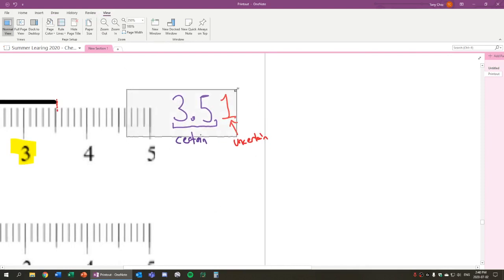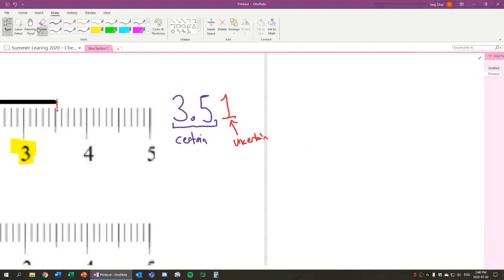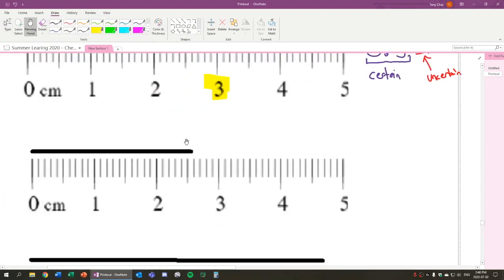Let's try the next one. The next one here is going to be 2 point what? Well, it's going to be 2 point. Now, if you look at it, has it passed the 2.6 mark yet? And the answer looks like it's no. So it's 2.5 what? It could be 2.58. It could be 2.59. But it's one of those values. Remember, the last digit there is uncertain. That's why it's fluctuating.